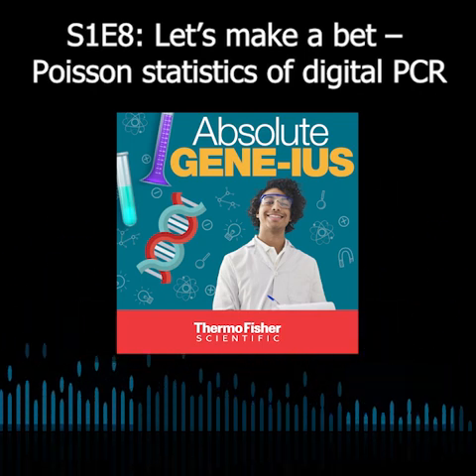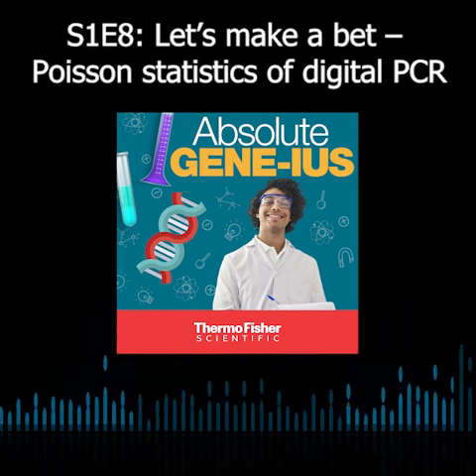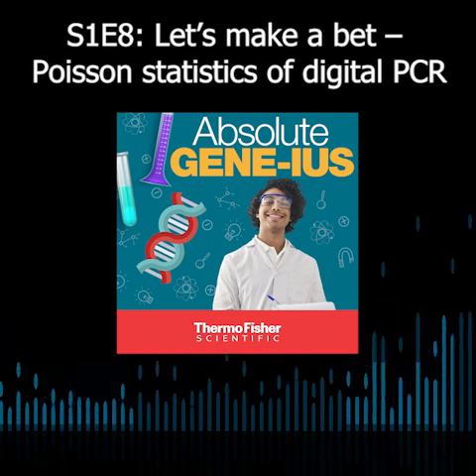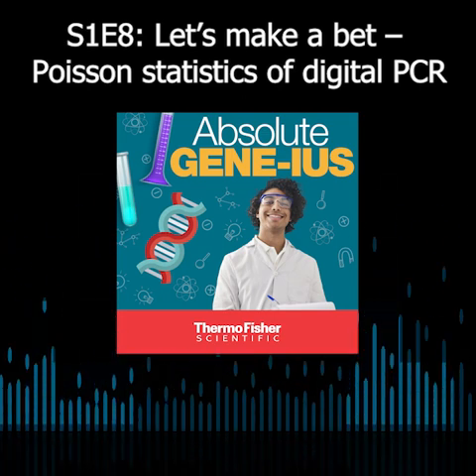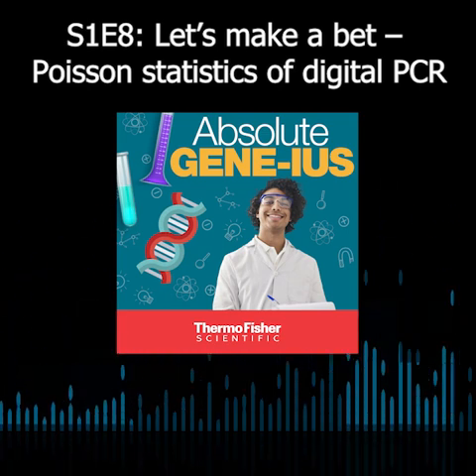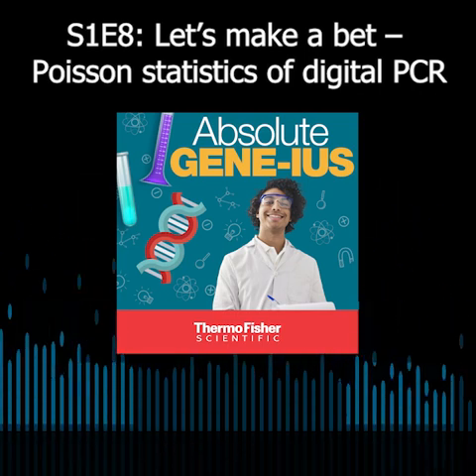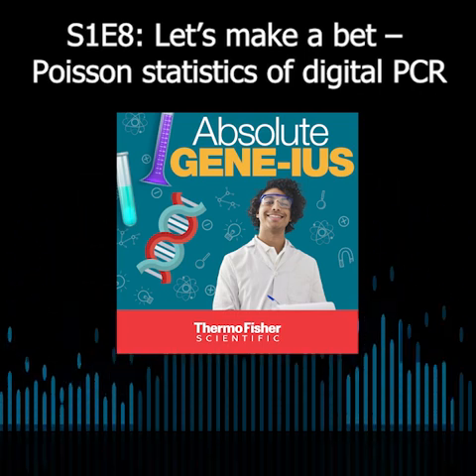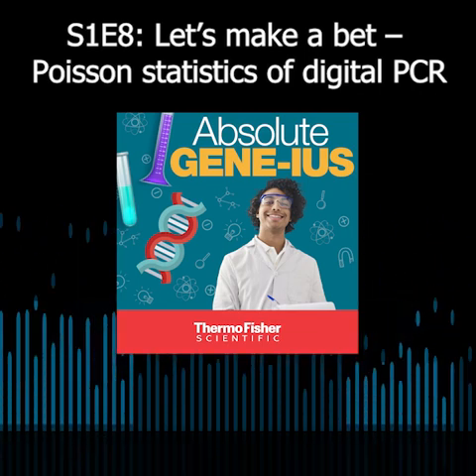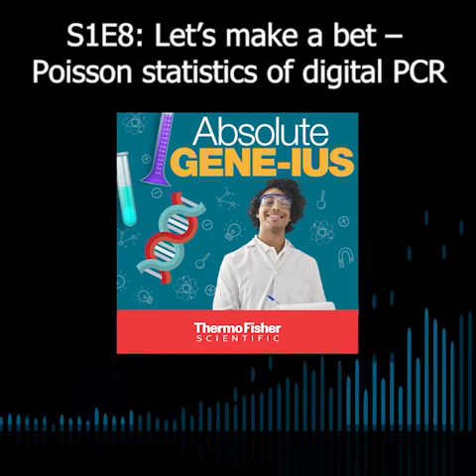Another one is precision. We talked about that before. You get better precision with digital PCR generally than you would with real-time PCR. Also, if you have a really low concentration, if you want to quantify at the lower end of concentrations, digital PCR usually is going to outperform real-time PCR. And finally, another point I like to make is looking for rare targets that are in a sea of wild type or a sea of sequences that are really similar. In that case, digital PCR can often get better resolution than real-time PCR would.